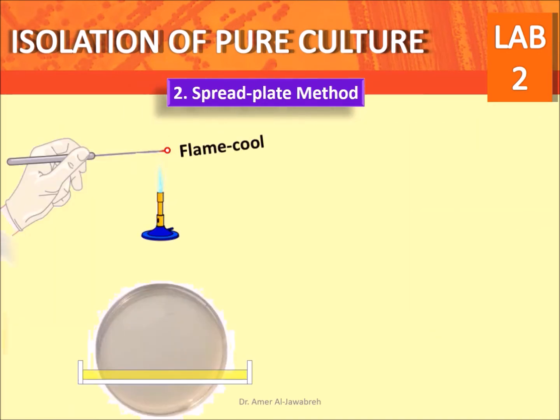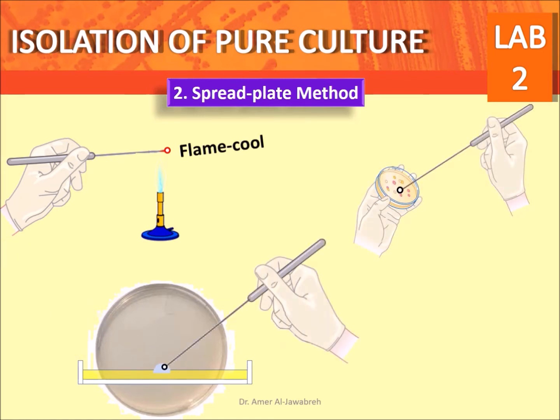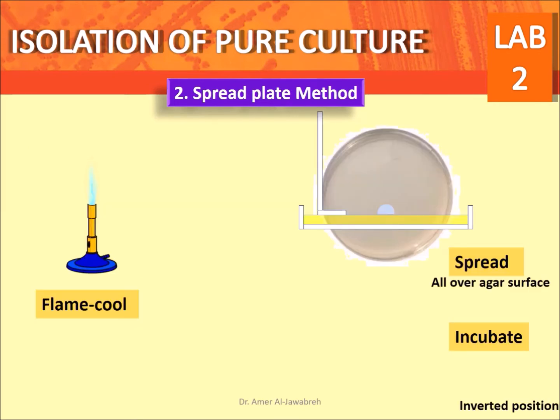Second, spread plate method. With a sterile pipette, add a drop of sterile water in the center of the nutrient agar plate. Flame and cool the loop, select an isolated colony and transfer it to the drop of water on the plate and mix gently. Cover the plate. Flame and cool an L-shaped glass rod. With the glass rod, gently touch the drop of water with bacteria and spread back and forth on the entire plate.